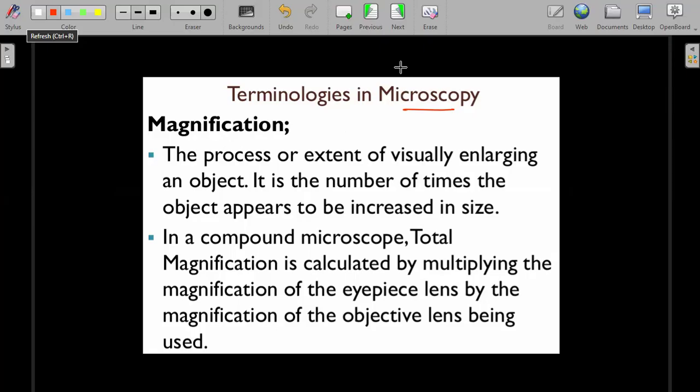It's like enlarging something small to something visual. Yeah. So we are trying to enlarge something which is small. You make it big so that you are able to see, isn't it? Something very small, something very tiny, you are trying to make it visible. So that's what magnification is all about. We'll talk about the formula for magnification as we move on. For now, I just wanted you to understand what magnification is all about.